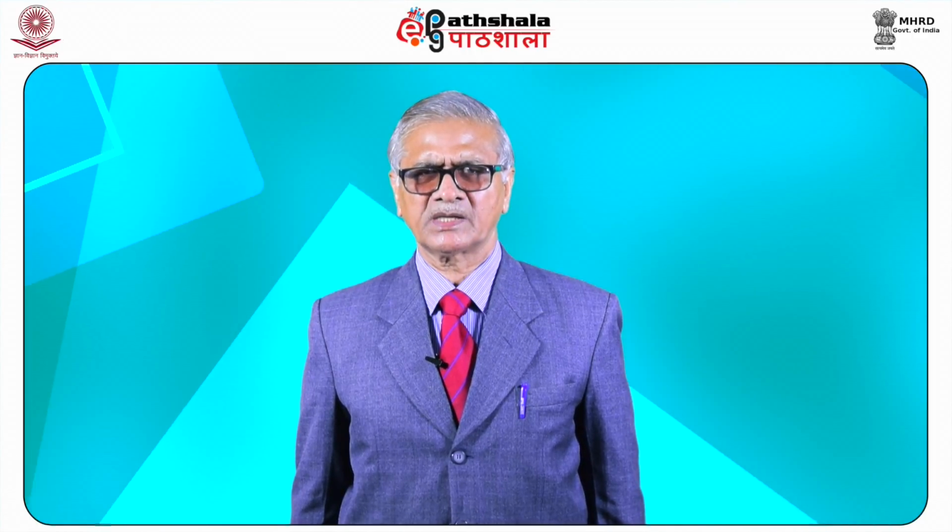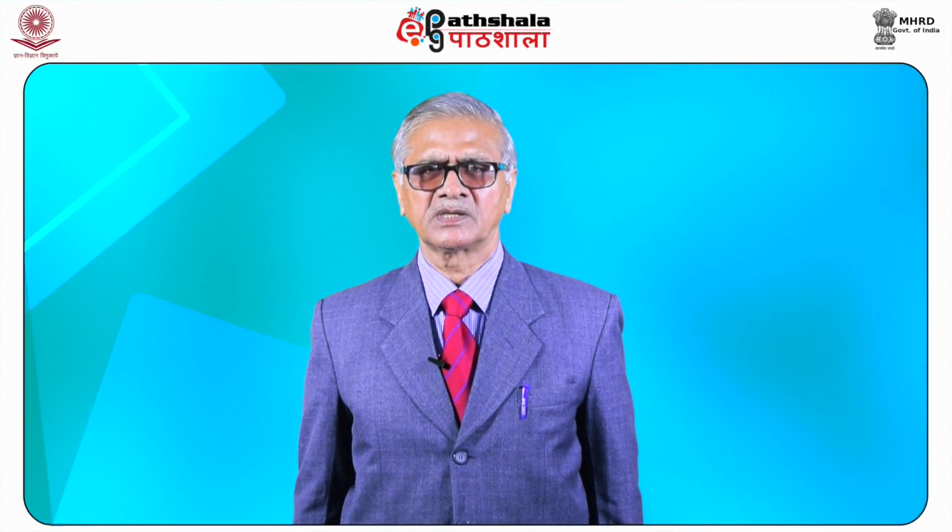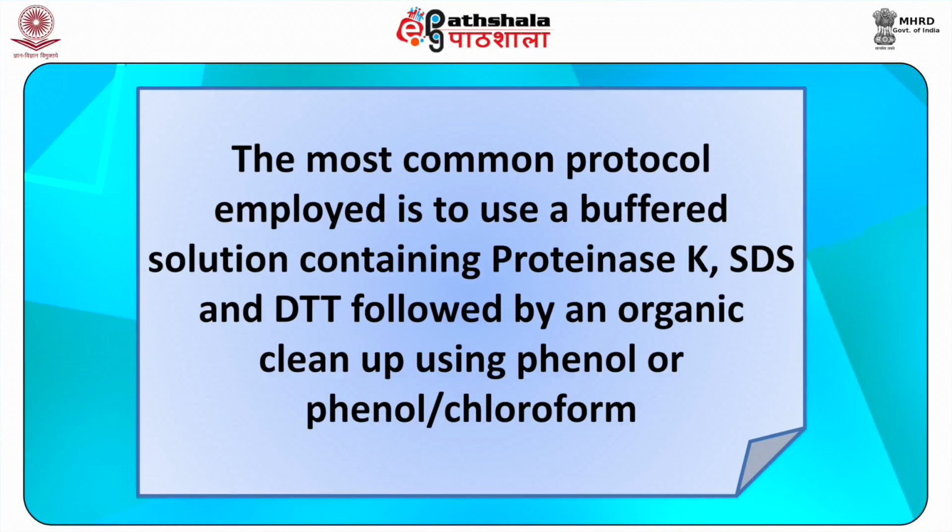Generally, during postmortem examination, there is no blood, and the superficial soft tissues may show signs of putrefaction. In such situations, targeting deeper tissues is often more successful than attempting to use more superficial tissues as a source of DNA. Normally, tissue samples require additional treatment to release DNA and purify it from the cell debris and other decomposition products. The most common protocol employed is to use a buffered solution containing proteinase K, SDS, and DTT, followed by an organic cleanup using phenol or a phenol chloroform mixture.